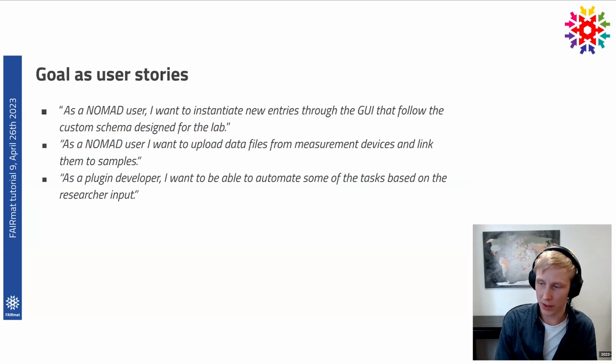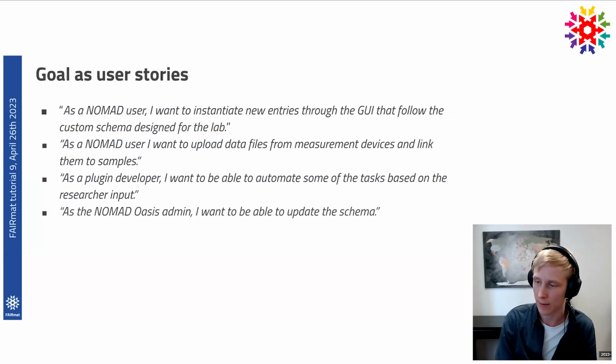As a plugin developer, so maybe within your lab you have a person that is responsible for this development, you want to be able to automate some of the tasks. So you put some functionality into the schemas that make the life of the researcher easier. So maybe there are some post-processing steps, maybe some fields are filled automatically and things like this.